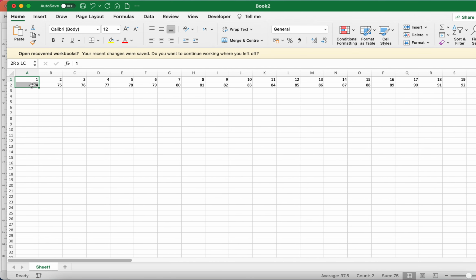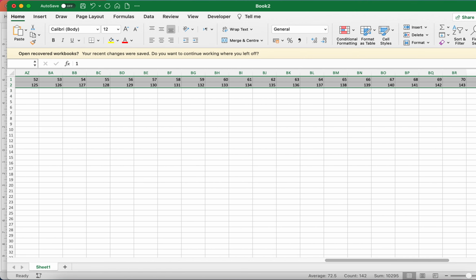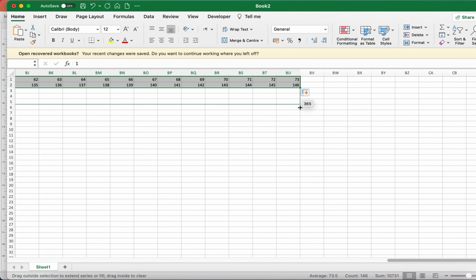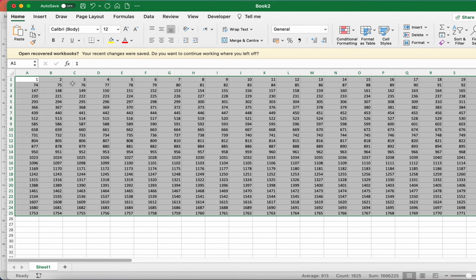Now we select all of these cells, and we go up to the number of diffraction patterns that we have. So now here we have the number of diffraction patterns according to the way we've scanned our sample.